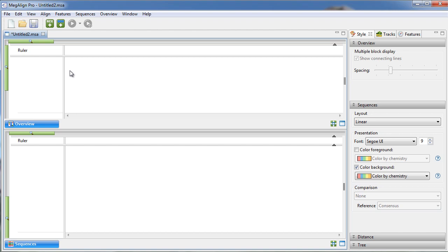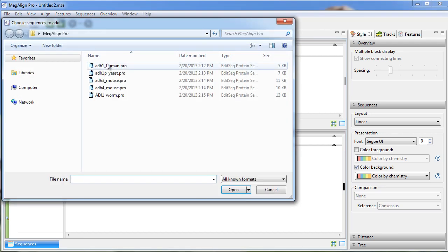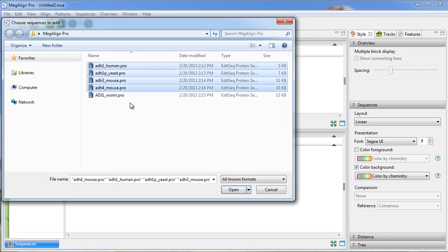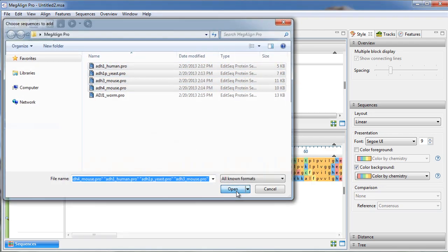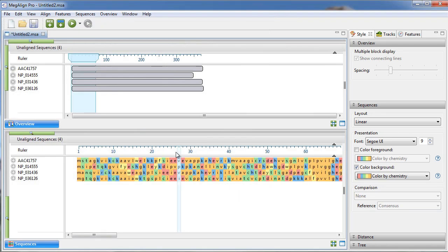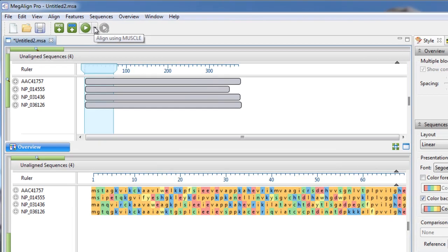MegAlign Pro is DNASTAR's application for multiple sequence alignment. To get started, simply add your sequences to the project and then select your alignment method.